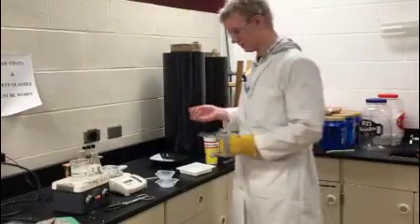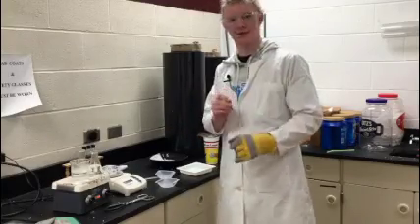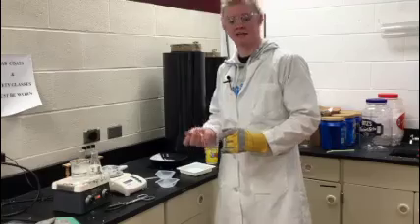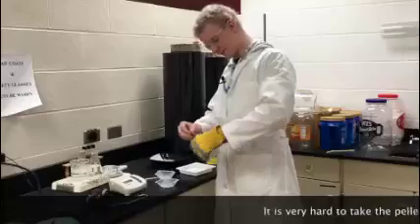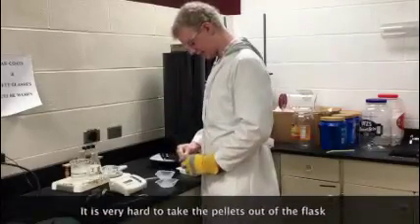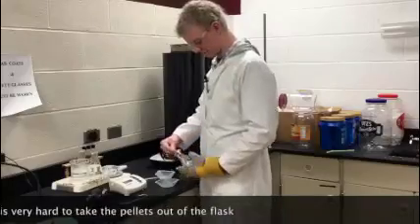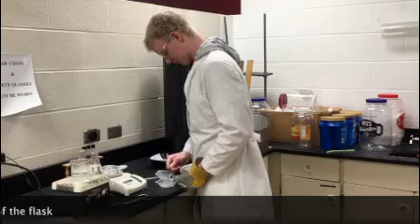To help take it out, you are going to want to have a leather glove on so that your hand doesn't burn. You are also going to want a rod to help take it out. You're going to stick it in there and just take it out like that.